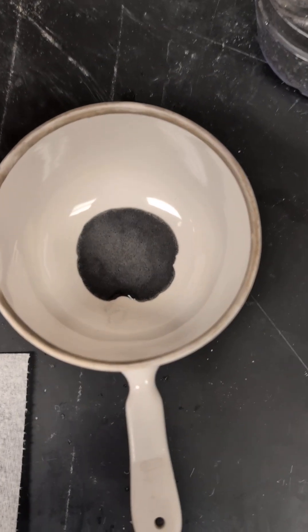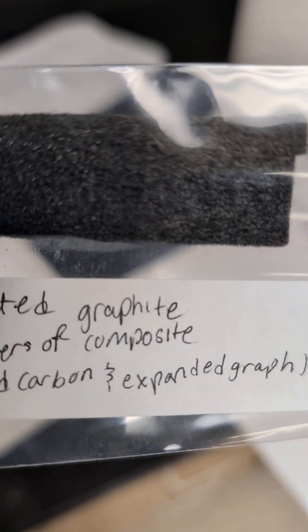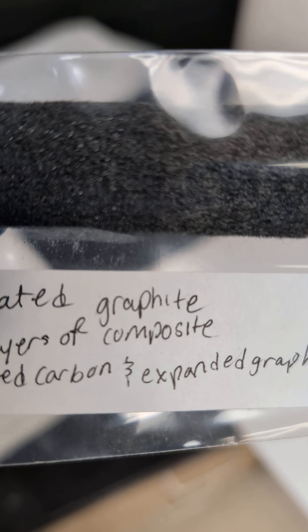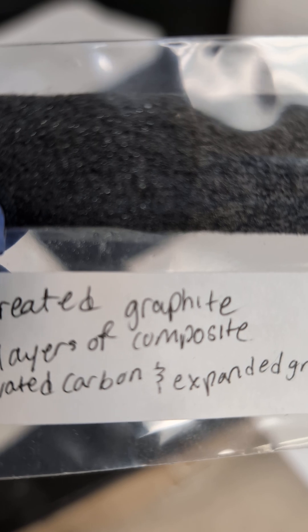And then we apply it to graphite felt. That sample has been applied to two-thirds of the top and bottom areas — you can see a subtle difference. We then use a hair dryer to remove a lot of the water, and then with a hair straightener we press it with heat to compress it somewhat. We will also get scanning electron microscopic imagery of the composite.